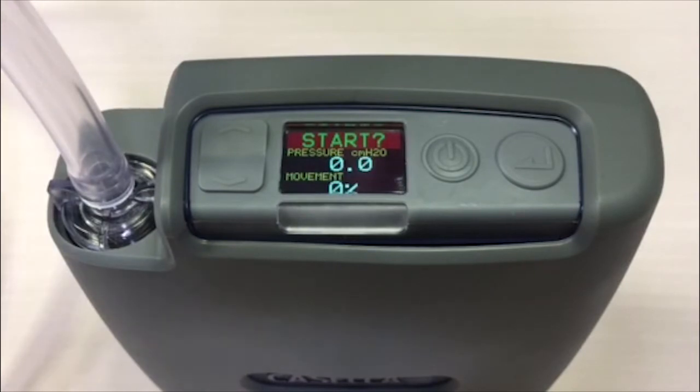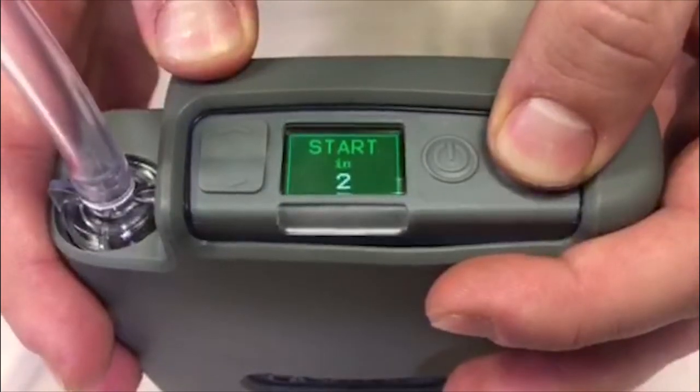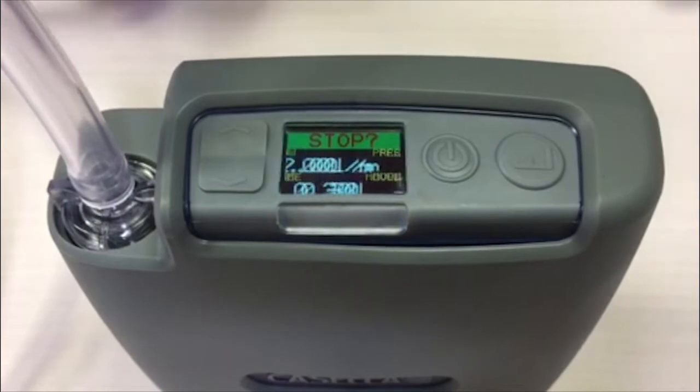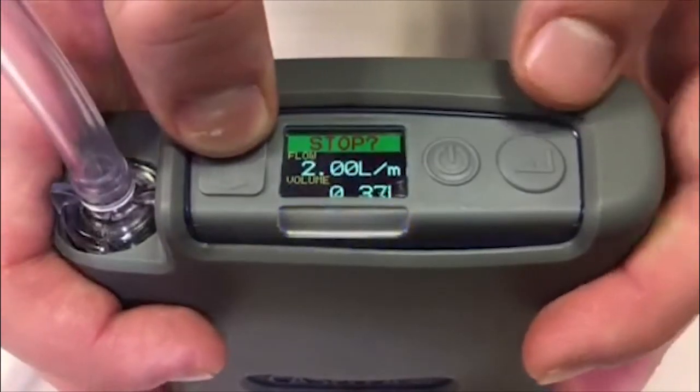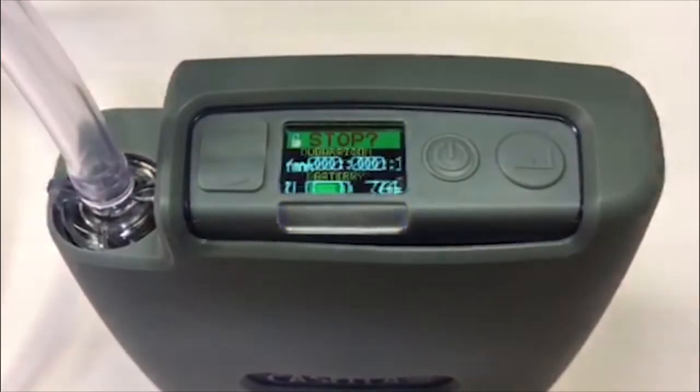Once the pump has been removed from the flow meter, hold the enter key down to start the pump. It will then do a countdown of 3 seconds and the pump will start running. It is important to lock the pump to prevent tampering. To lock the pump, hold the up cursor down and tap the enter key 6 times.